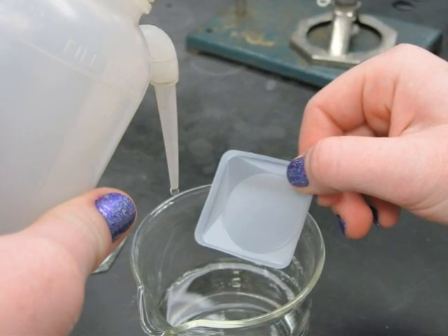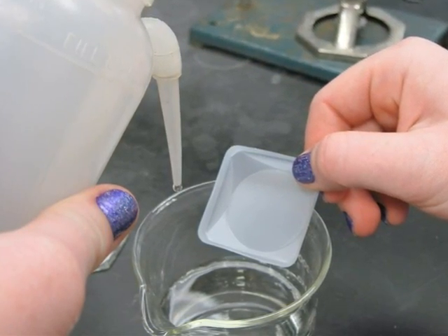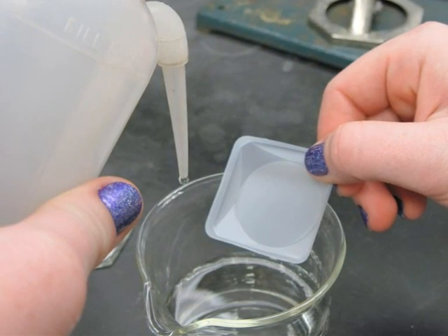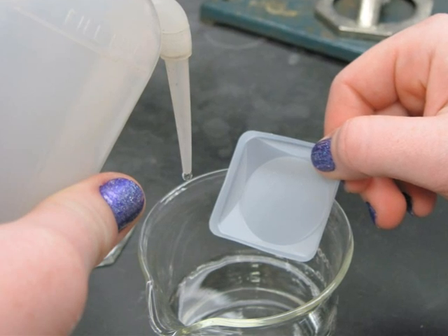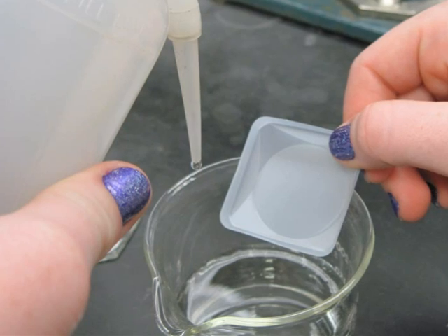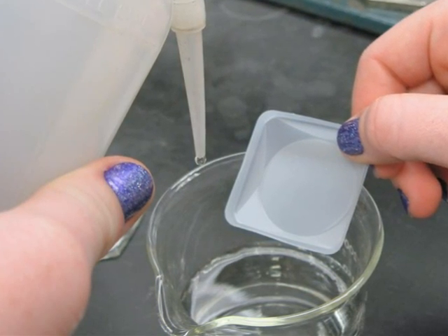Quantitatively transfer the sample to a 250 milliliter beaker. Use a wash bottle to ensure the complete transfer of the sample. Add approximately 150 milliliters of distilled water and 1 milliliter of 6 molar nitric acid to the beaker.